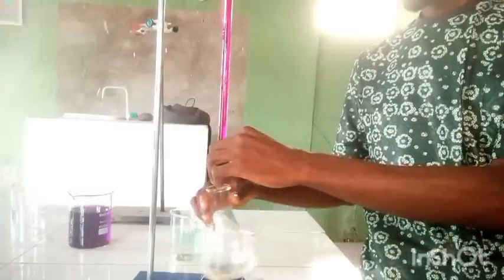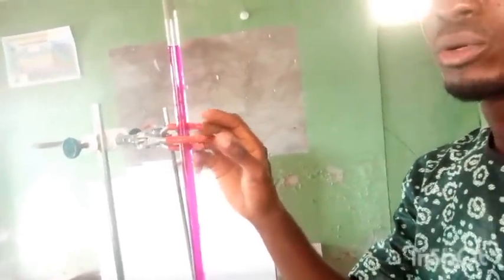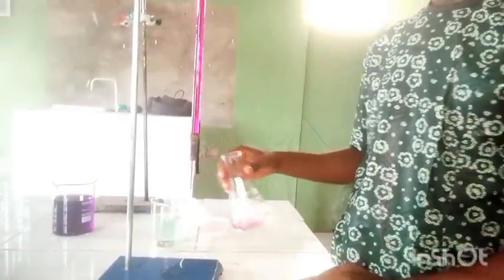The colour hasn't changed yet so we continue. The colour is now pink, so we can conclude the reaction has reached the endpoint. The burette reading is 19.8cm³ — that is our first titre value of 19.8 out of 50cm³.